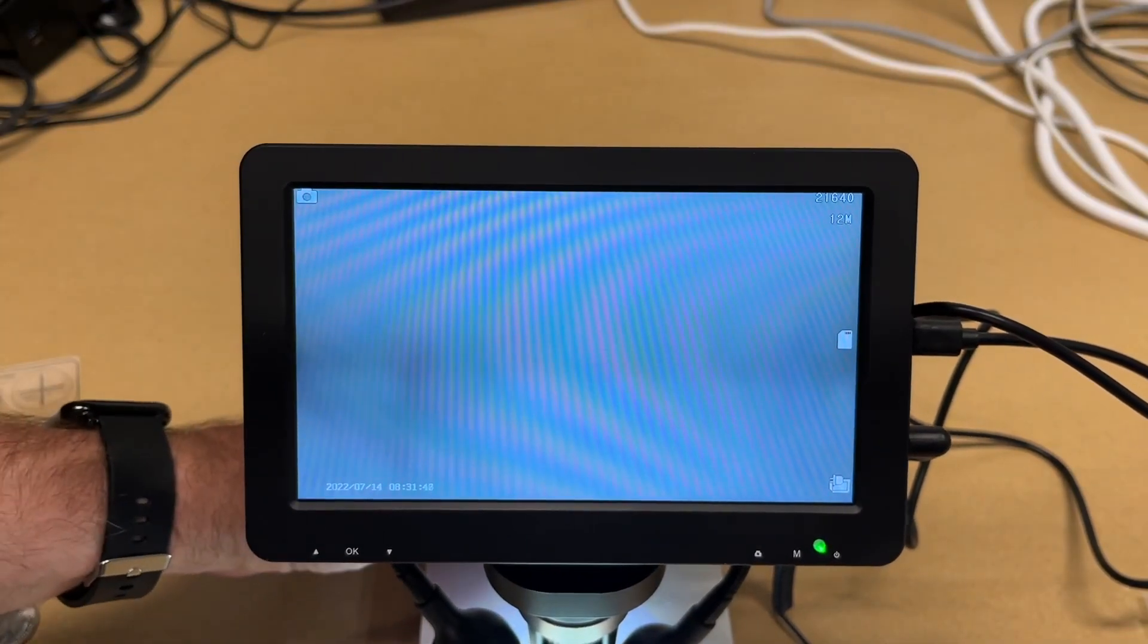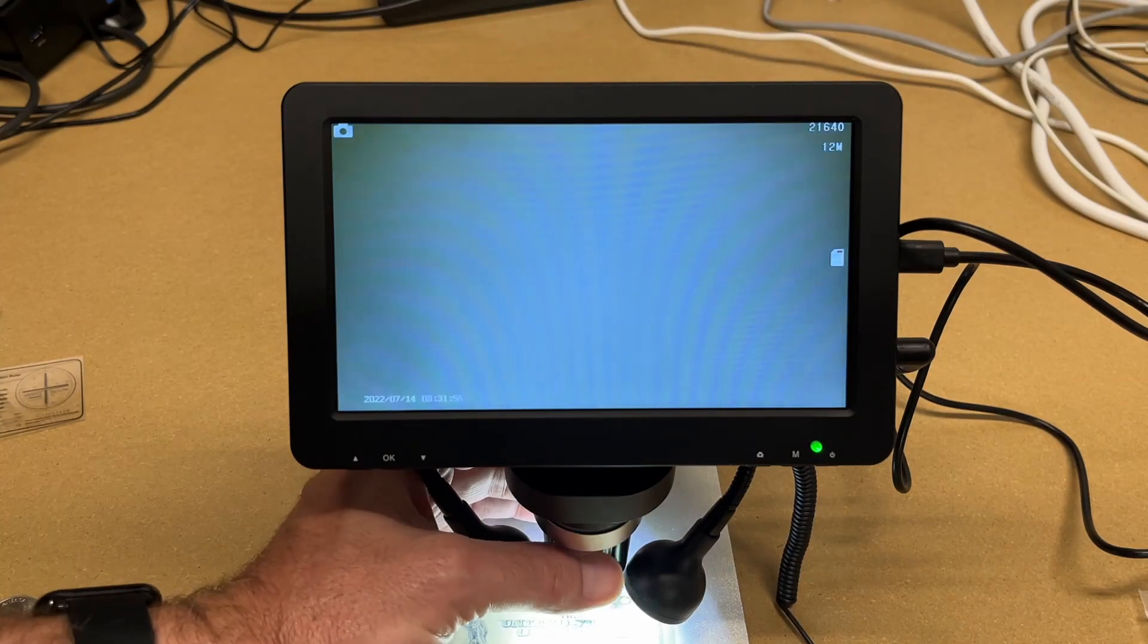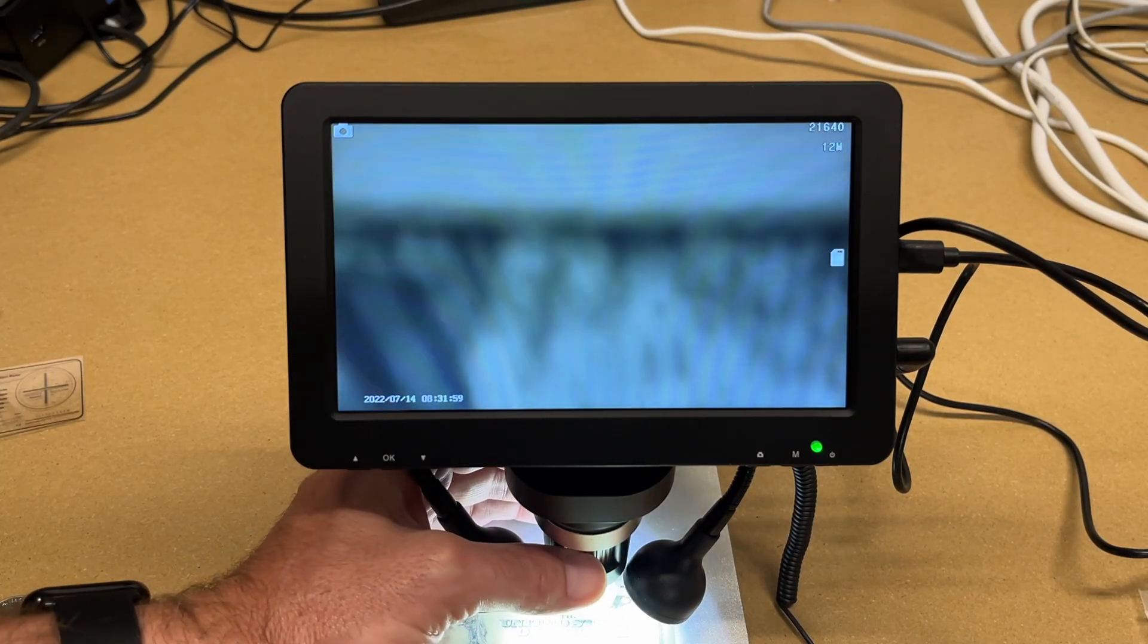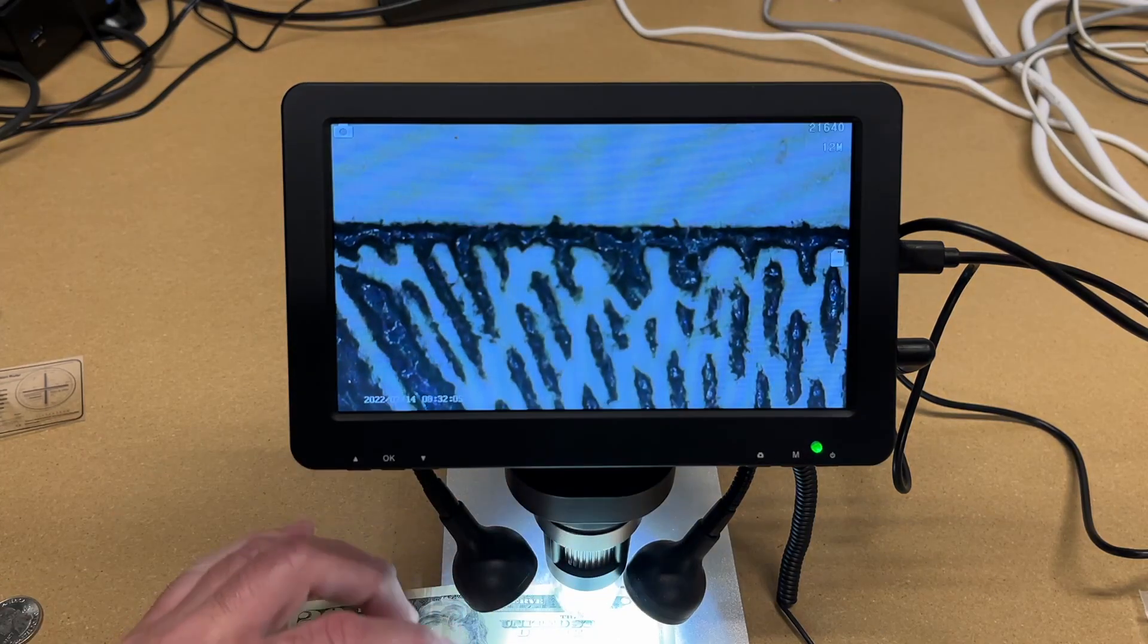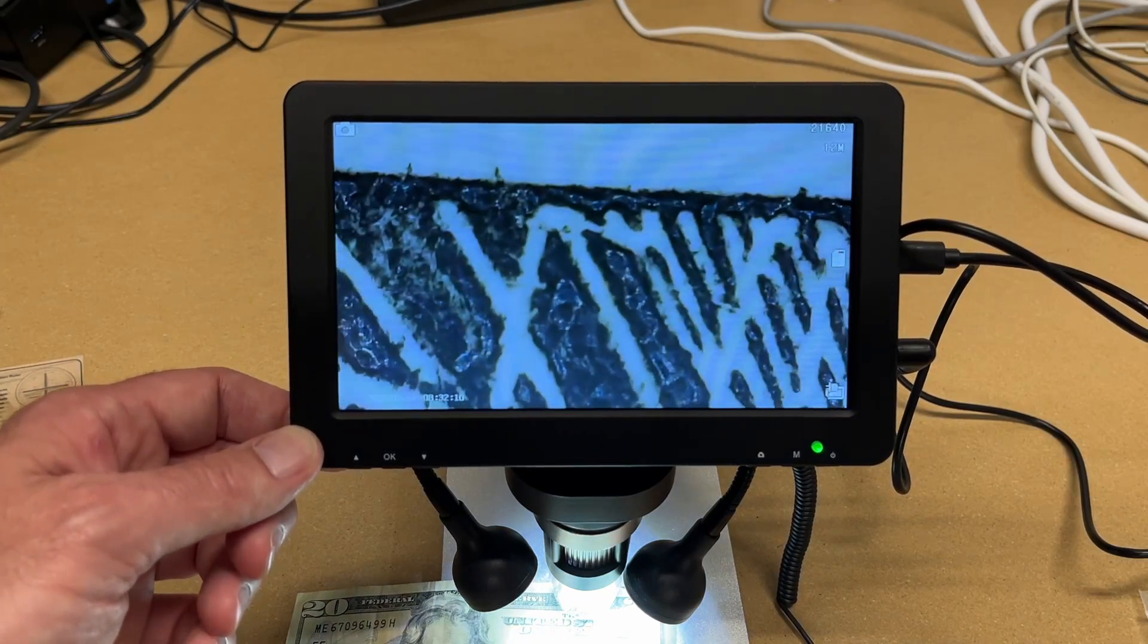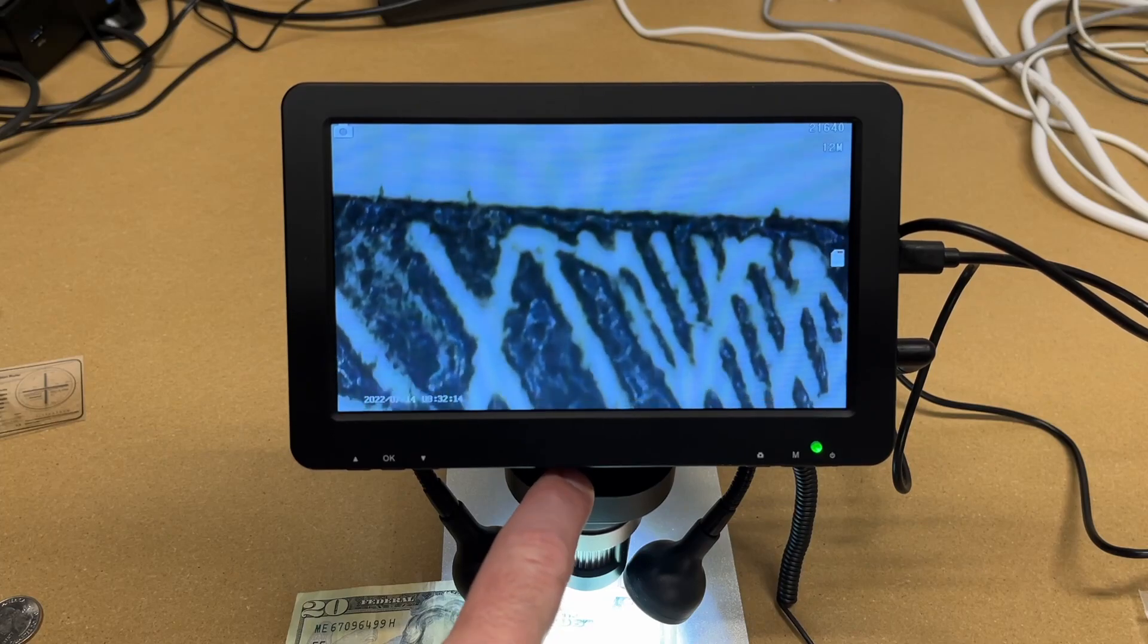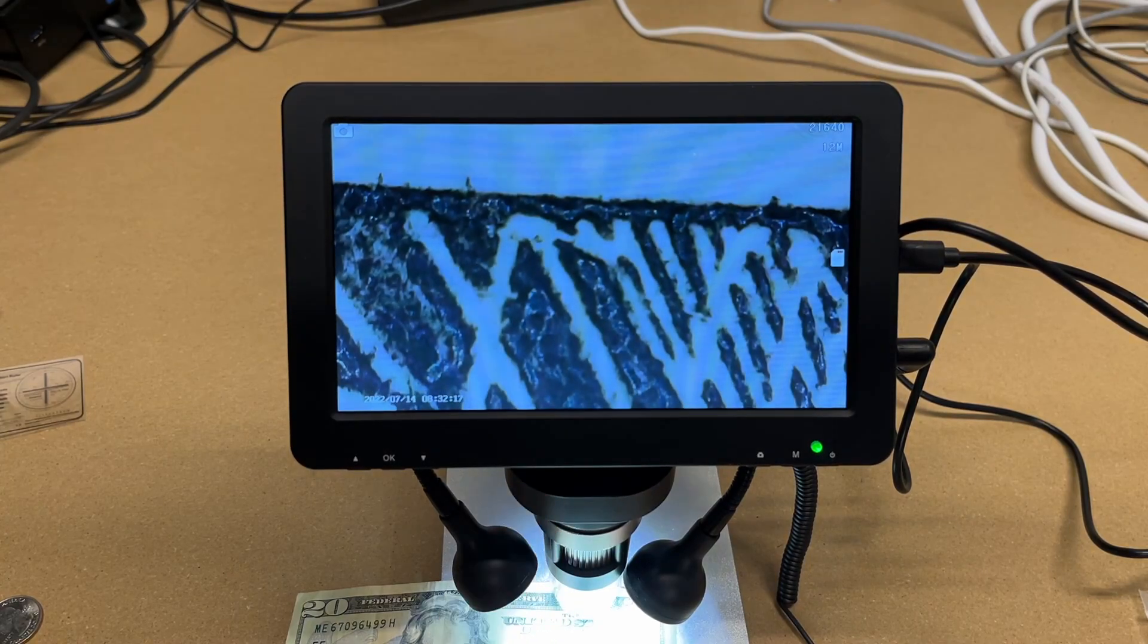It's kind of hard to see here, but I can adjust this focus. And this is open on the front or back. So I will turn this until it focuses in. Like so. So now I can move this around. And this is very sensitive. If I move this up and down with my finger, this is pretty sturdy here. But I can flex it just a little bit and it will mess the focus up. So that's why it's nice having this rigid platform. Because while I can push on this, you're not going to push on it typically. And it's very sturdy. This mount is nice and stiff. So you can really lock it in.